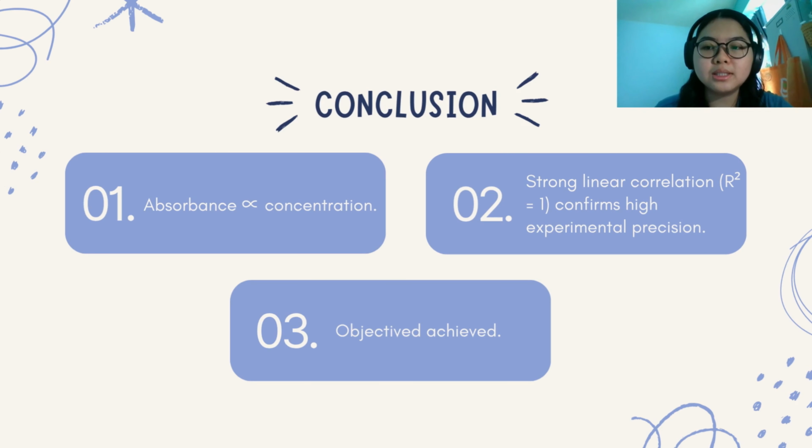These results are consistent with Beer-Lambert's law, which shows that absorbance is directly proportional to the concentration. The strong linear relationship also indicates that the experimental results are reliable. Therefore, the objective of these experiments was successfully achieved.